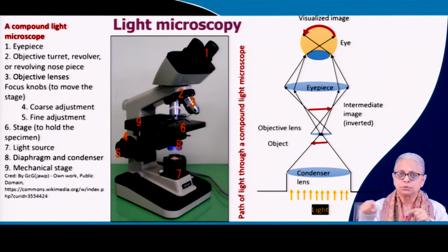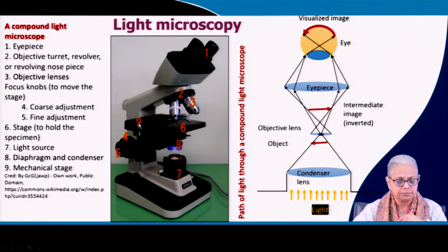You have rulers on both sides, in the X and Y direction, you might say. You can see the calibration, or the calipers, whatever you want to call them. You can measure the amount of movement in both directions. That level of control is there with the fine adjustment.